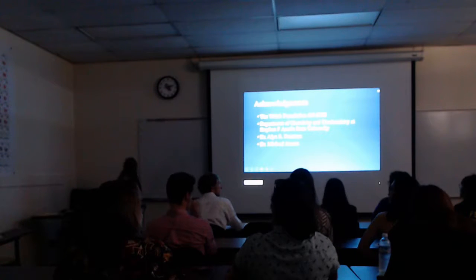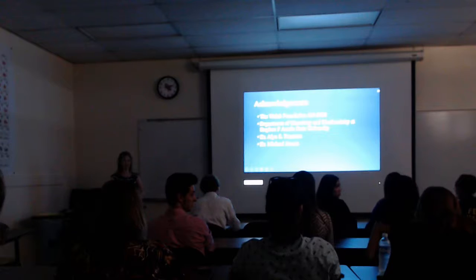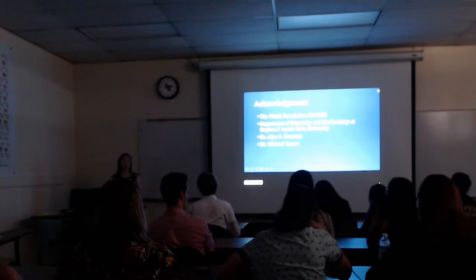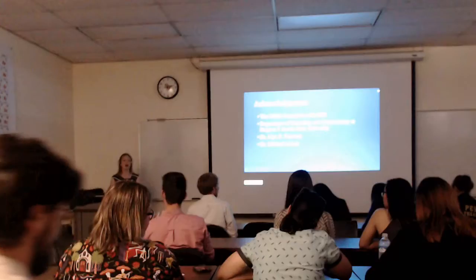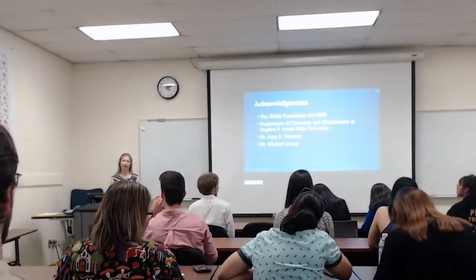Any questions? On your UV-vis studies, and the AA studies, may I ask why you used copper and nickel? We used copper and nickel first because they have a visible color, so that we were able to use them on the UV-vis, as well as because they were inexpensive materials, and we also already had them in the lab.